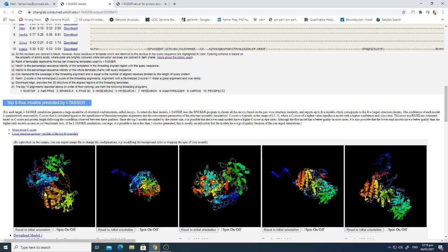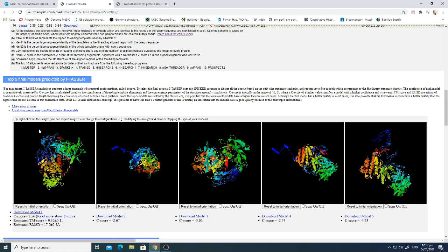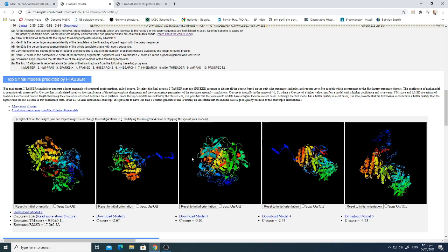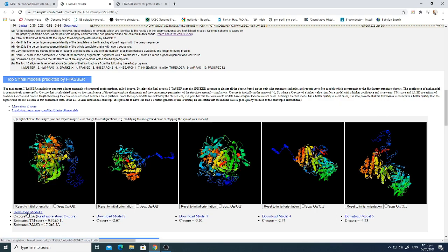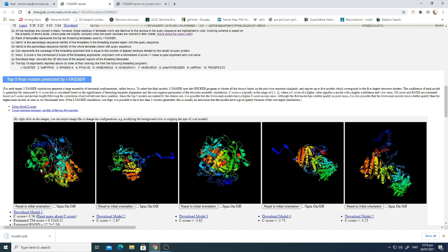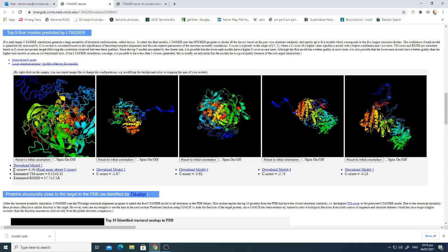The top five final models predicted by I-TASSER are shown next. You can click on each structure to see all the helices and beta strands predicted for your protein of interest. You can download each model by clicking 'Download Model', which downloads the PDB structure for further analysis. You can also zoom in and zoom out to view the structure on the website.